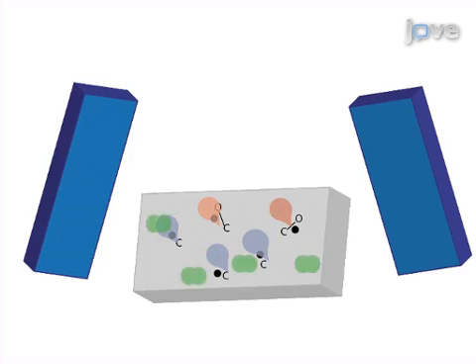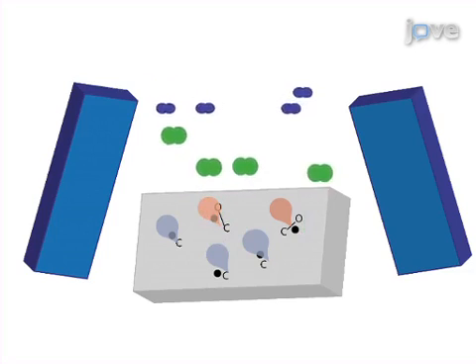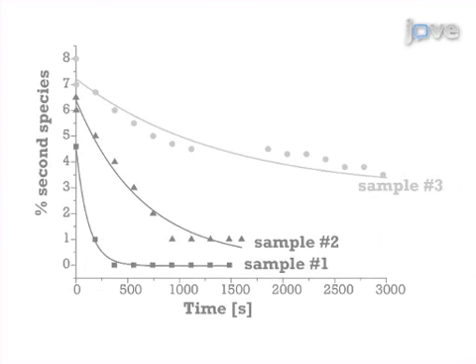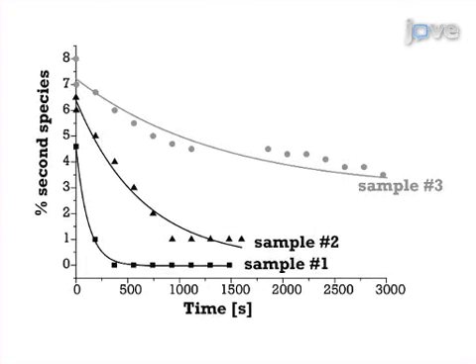Next, air or oxygen is flowed through the carbon sample in order to follow the disappearance of carbon radicals in an oxidizing environment. The results show that carbon substrates are affected differently by oxidation treatment depending on their composition and pore density, based on BET, FTIR, and EPR measurements.